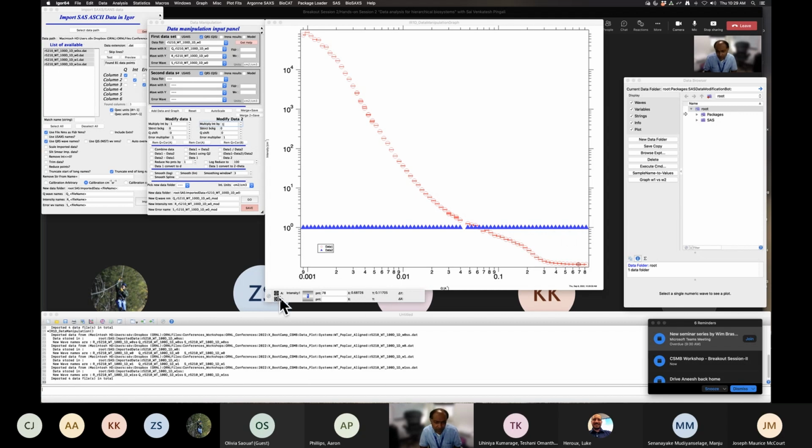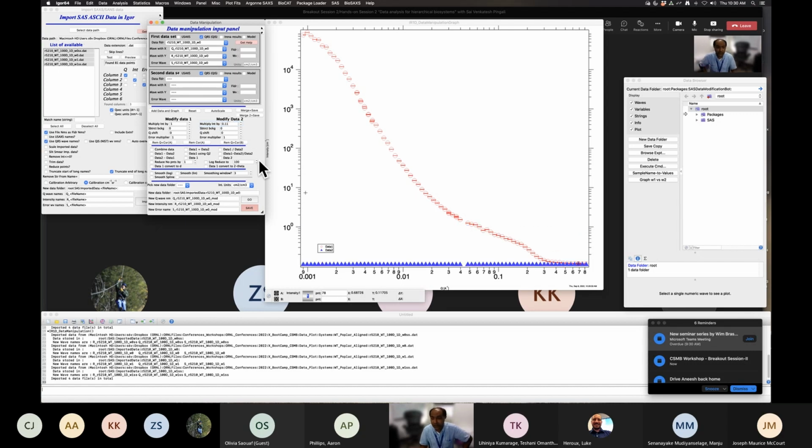That's about 0.1175. I take this. Oh, that's at 1, so shouldn't matter. So I just multiply into 0.11, let's say. Right, that brings us close. You can see over here. So now I just do data 1 minus data 2. These are the operations here.